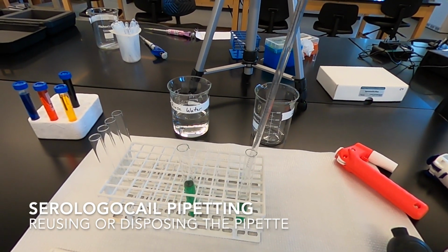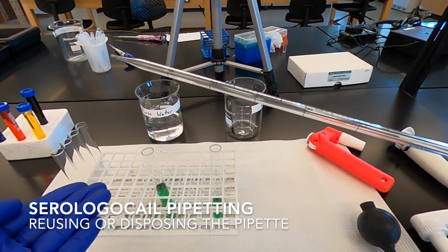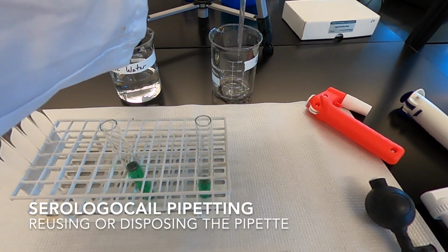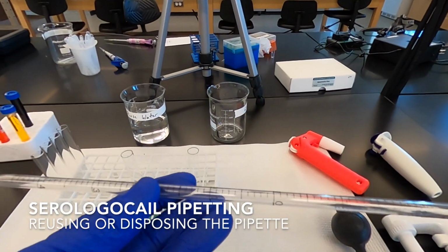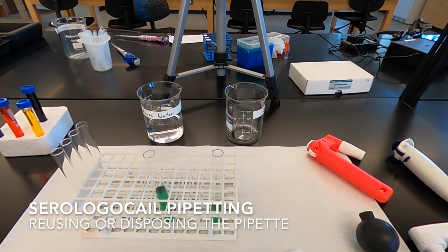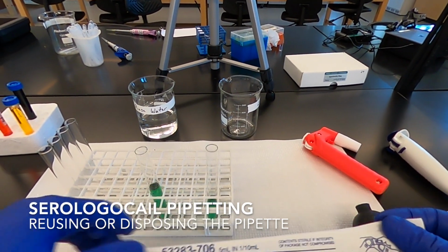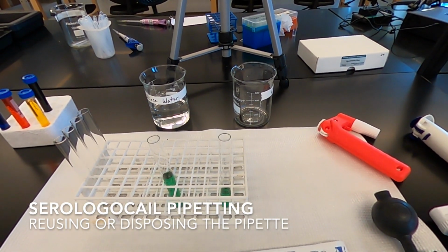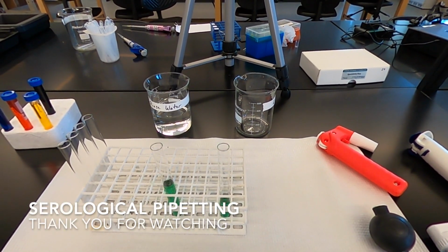So lastly, depending on your workflow, you might be able to reuse a pipette. In this case, I'm just pipetting dyes around, so if I want to switch dye colors, I can probably just rinse my pipette. So I have some rinse water here. Just drop, drop. Maybe do that a few times, and that'll be good to go. Alternatively, if I'm working with something sensitive, like tissue culture or other stocks where back contamination is a serious risk, I can just simply dispose of the pipette. Typically, we re-sleeve them, and we put them in the appropriate waste receptacle. Now, depending on our labs, we might reuse the pipettes between sections to save on resources and the environment because these are plastic. So that concludes our serological pipetting video.